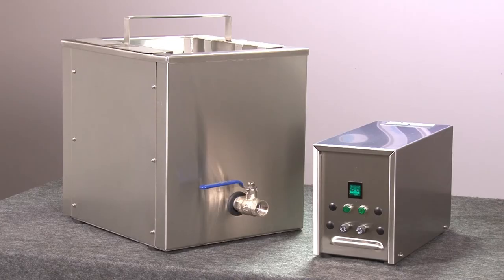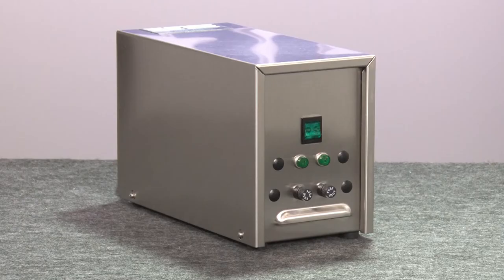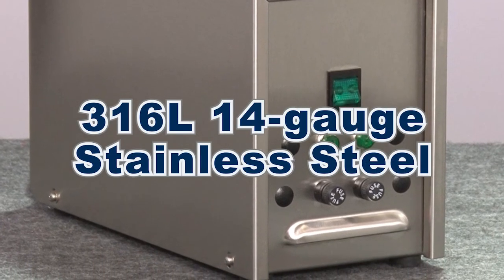A separate industrial-grade ultrasonic generator drives the transducers to produce the cavitation energy required for the powerful cleaning action. The generator housing is also manufactured with 316L stainless steel.